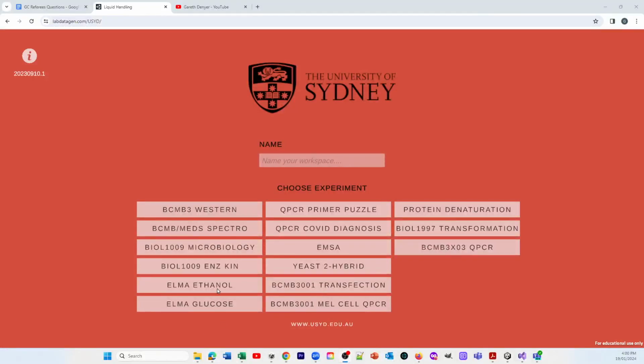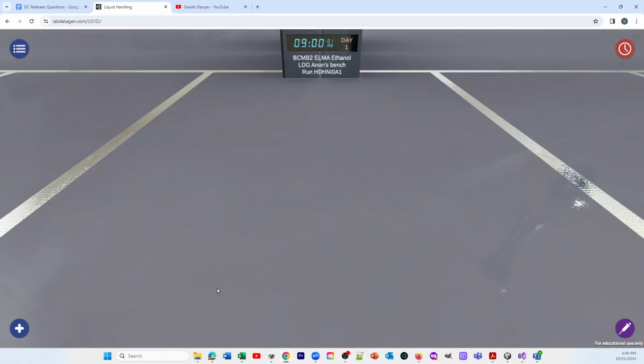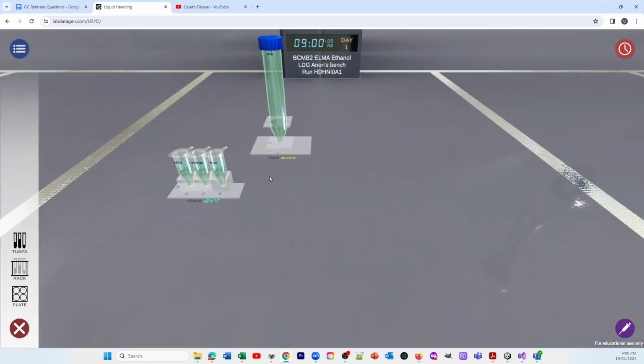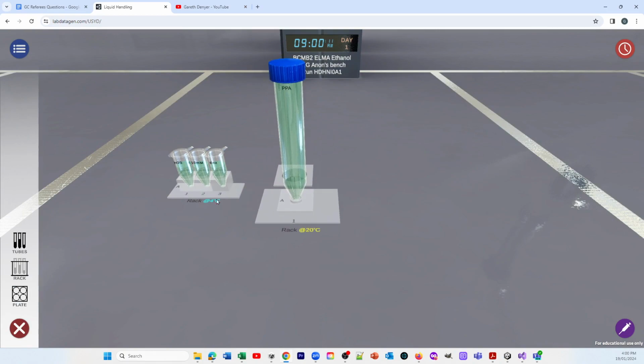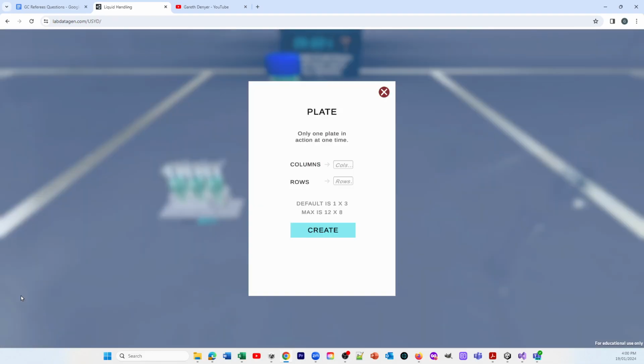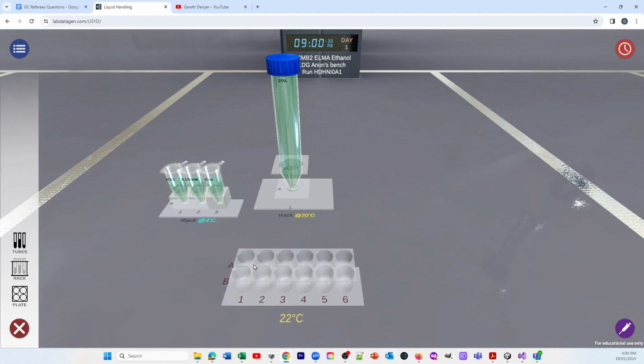Okay, so the idea of the data generator is it allows students to do experiments virtually, with results which are pretty realistic. So students can create sets of tubes containing chemicals. Here I've got tubes containing enzymes, ethanol, chemicals that are going to develop a colour when those things are mixed. The reactions can take place in all sorts of vessels, tubes, but most of the time students will be mixing the chemicals together in.